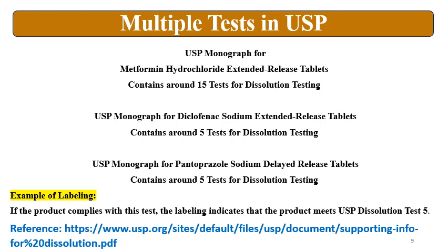And this is because the extended release profile can be achieved by different technologies. And all these products will be bioequivalent, will be approved by the US FDA, and the applicant will submit the data for the new dissolution test to be included into the USP. So these are 15 dissolution tests.